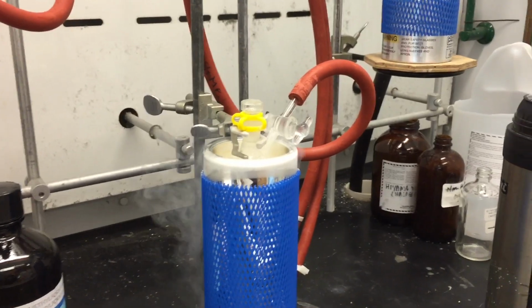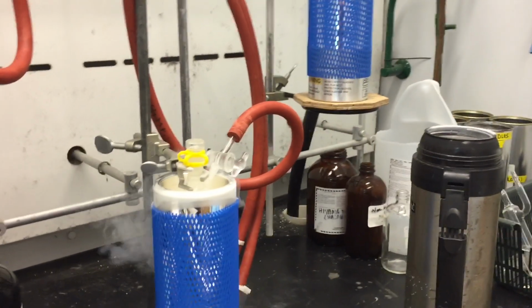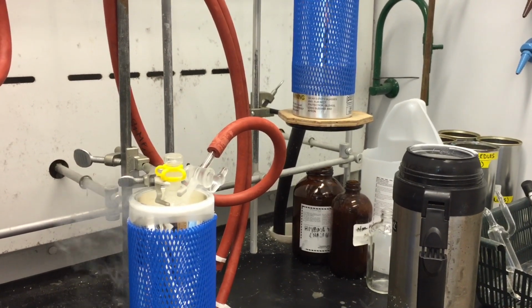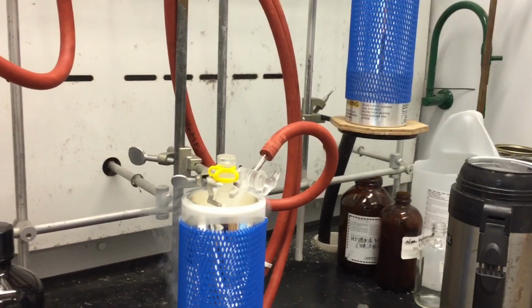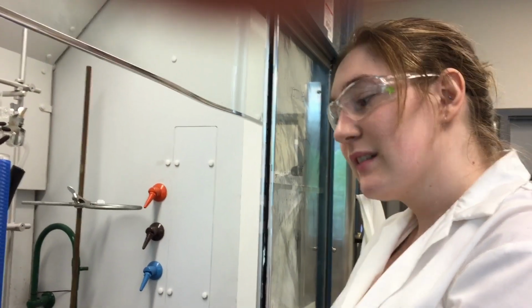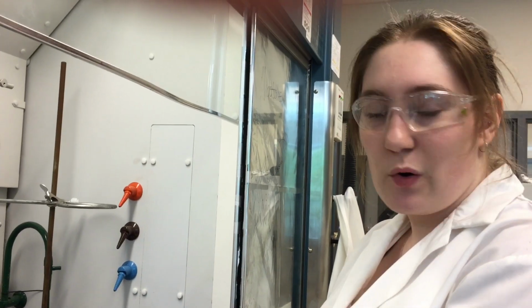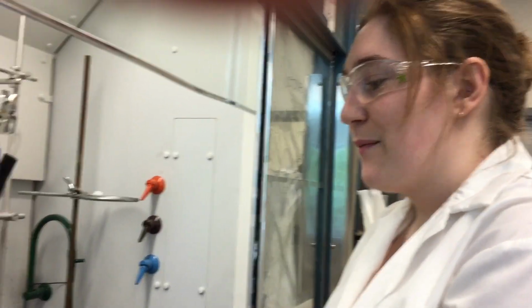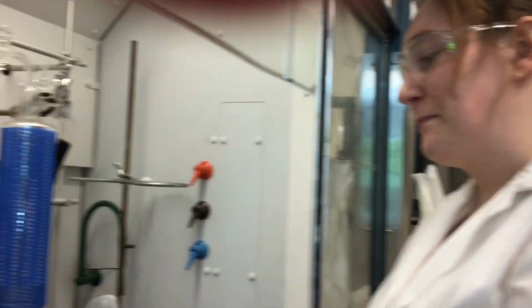So right now we're pumping, which is removing all the volatiles from the solvent. My rule of thumb is I usually pump for a minute or two, just to be on the safe side. Realistically, as soon as you open the vacuum, the majority of the volatiles will be removed immediately. But I do like to err on the side of caution.